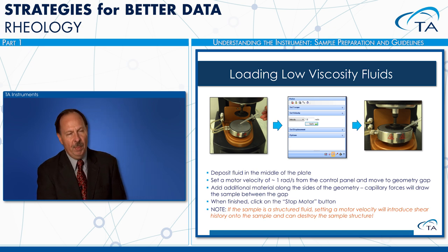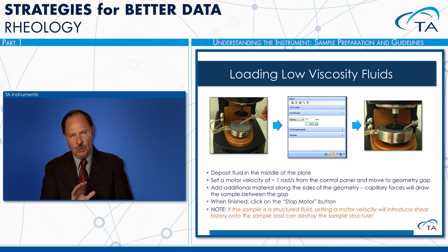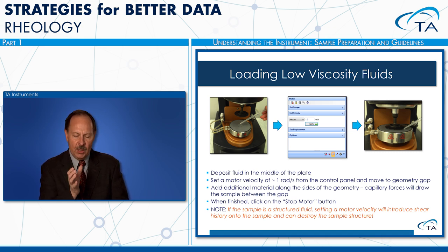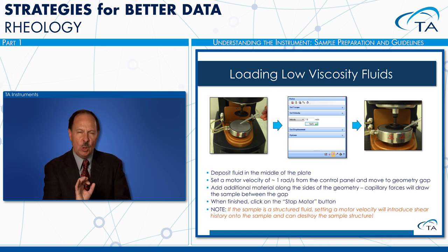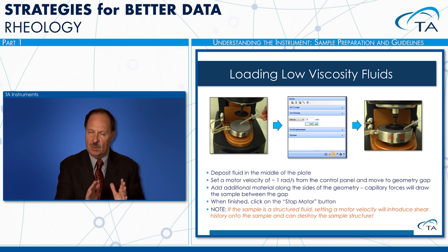So we go back to how you would handle and load a low viscosity fluid. In this case, what we're doing is we put a certain volume. And one of the features in our Rheology software packages is that if you enter the correct geometry and the dimensions and all that, the software will give you the absolute minimum amount of material that you're going to need to perform this test. Now, for a very low viscosity fluid like what we have here in the slide, you might put down even just a little bit less than what is called for from the software.